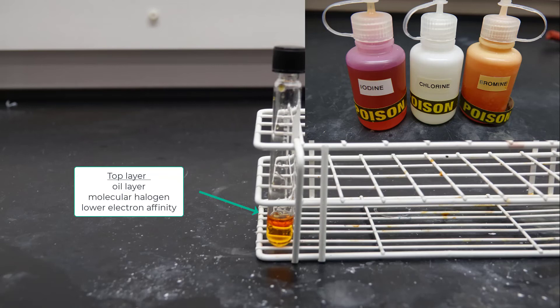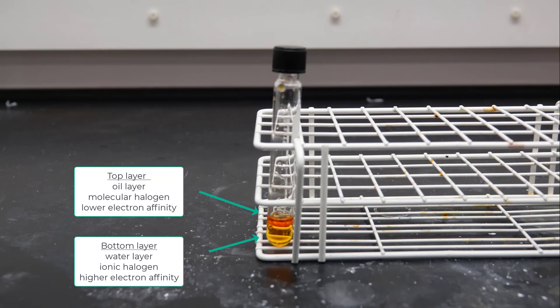Remember that the halogen that ends up as a molecule, the one you'll see in that oil layer, is the one with the lower electron affinity. The other halogen must be in the water layer in ionic form, and those were all colorless. Whichever halogen it is, is the one with the higher electron affinity.